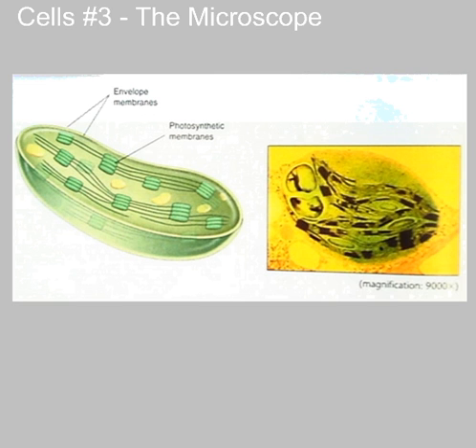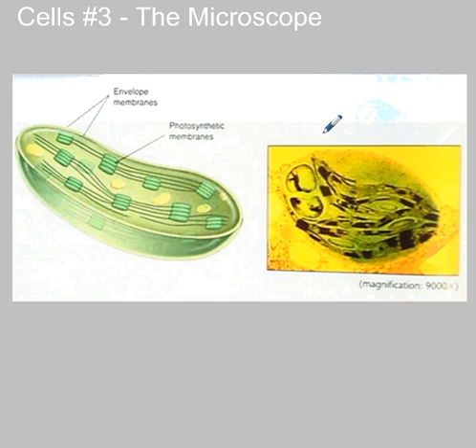Here we see a highly magnified image of a chloroplast. Chloroplasts are found in plant cells and other autotrophic microorganisms. This is where photosynthesis happens — capturing sunlight energy and turning it into glucose, storing that energy into chemical bonds of glucose to be used later by the cell.